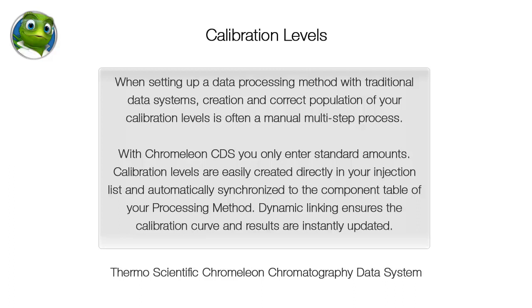Calibration levels are easily created directly in your injection list and automatically synchronized to the component table of your processing method. Dynamic linking ensures the calibration curve and results are instantly updated.